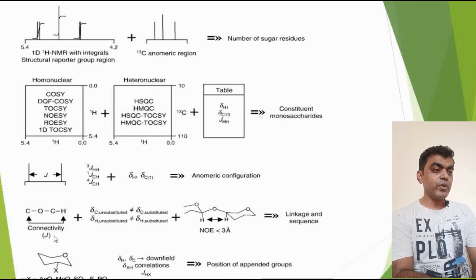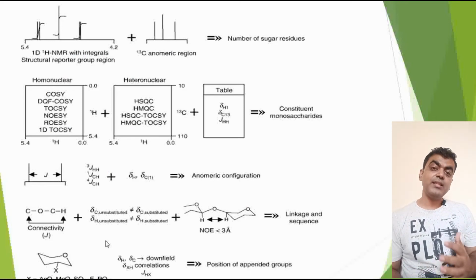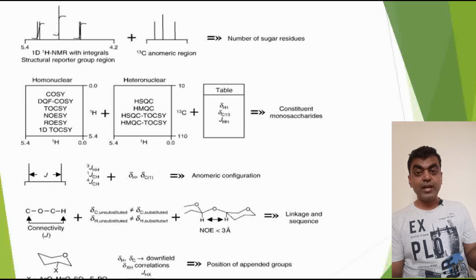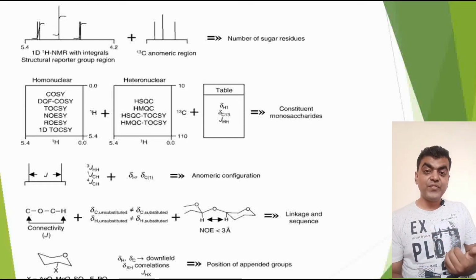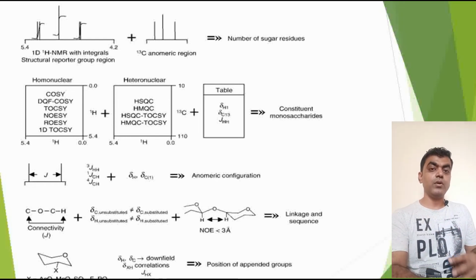and then you can also do it for a ring. So if it is a ring, if it is an aromatic structure, then their J value will be different. They will have a de-shielding, which we discussed, right? They will have a de-shielding effect because of the aromatic ring, and the resultant will be more downfield resonances, right? So all this information, when you pull together, you will get your structure. Definitely you will get your structure.